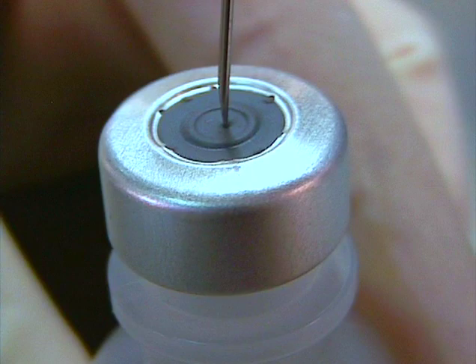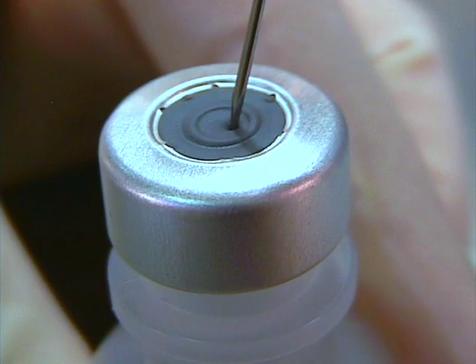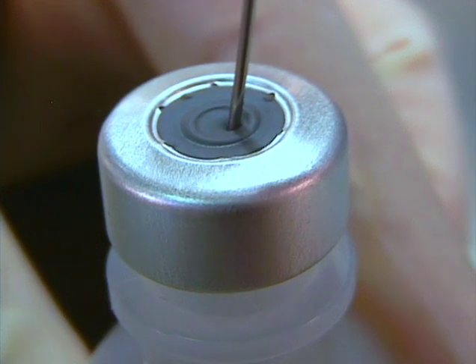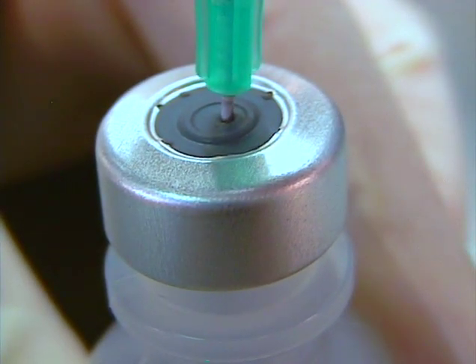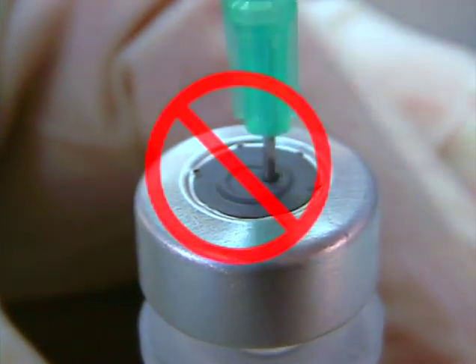Apply slight lateral pressure to bow the needle slightly in the direction opposite the bevel until the beveled angle is perpendicular to the septum, and insert the needle. Once the needle bevel has penetrated the septum, relax the lateral pressure and allow the needle to straighten. Only slight pressure is required to properly orient the bevel so that coring of the septum will not occur. Do not bend or permanently distort the needle during this procedure.